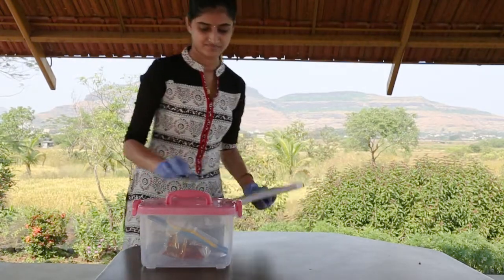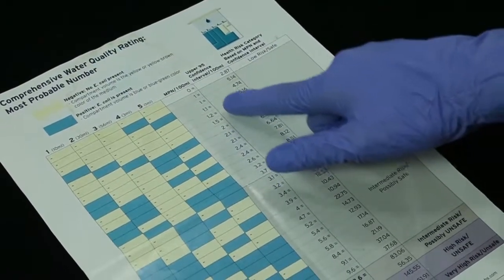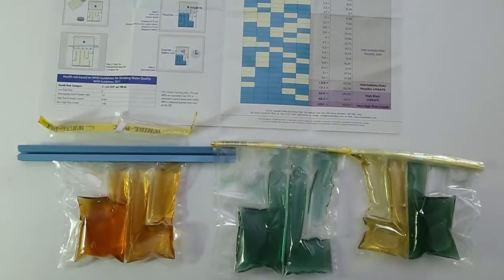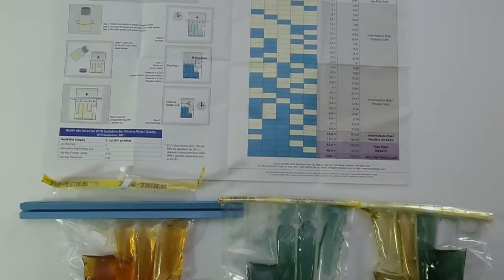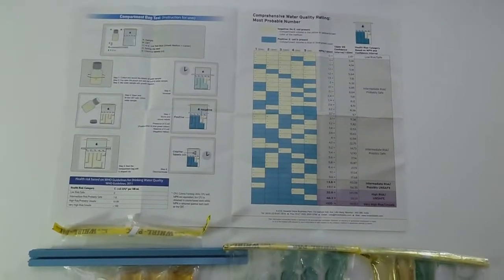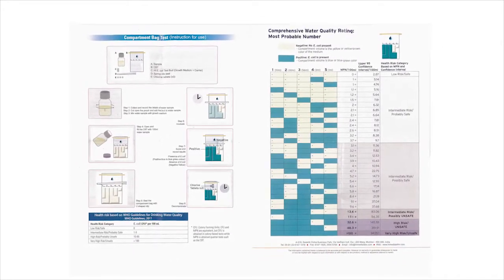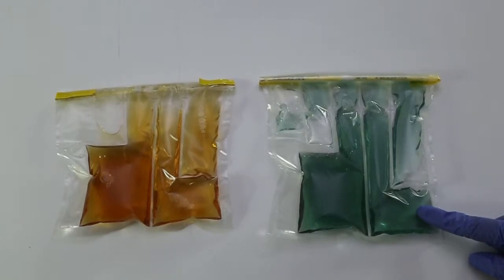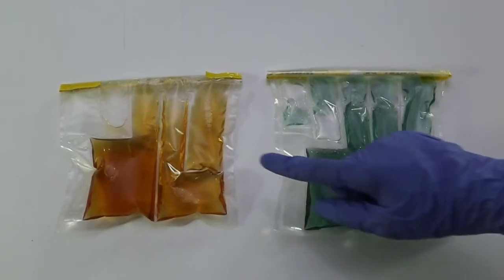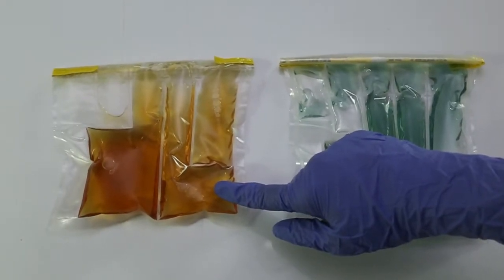After the appropriate incubation period, you are ready to score your E. coli test results. The concentration of fecal bacteria in the sample is estimated on the basis of the positive and negative compartments, giving a most probable number estimate — called MPN — of E. coli per 100 milliliters. Refer to the MPN table in the High E. coli instruction sheet to count positive and negative compartments in your sample. A blue or blue-green color indicates a positive presence of E. coli. A yellow or yellow-brown result indicates a negative result, or absence of E. coli.